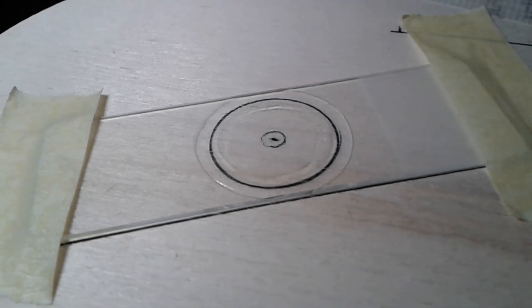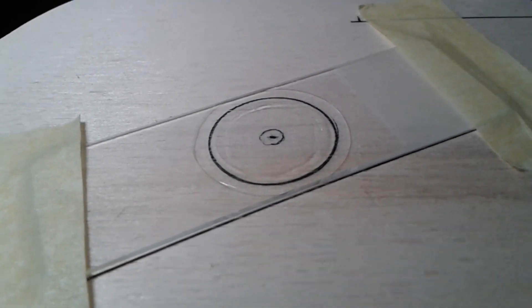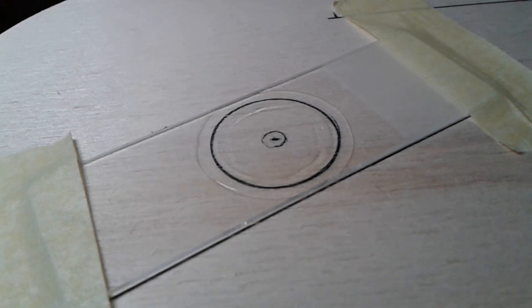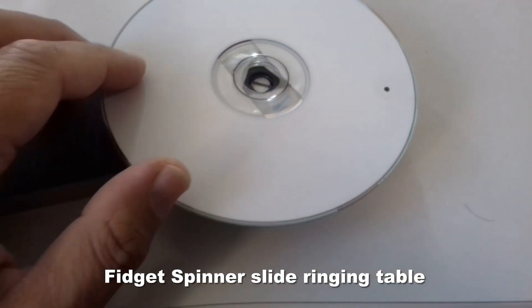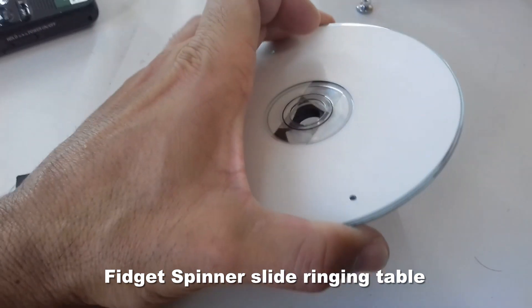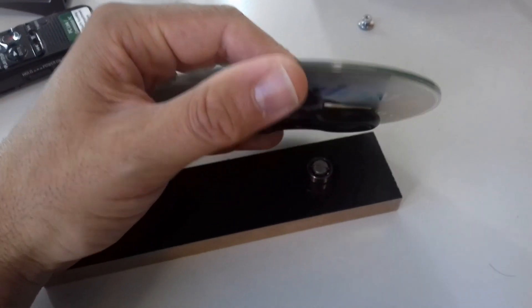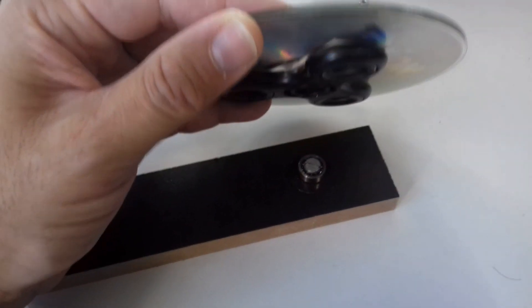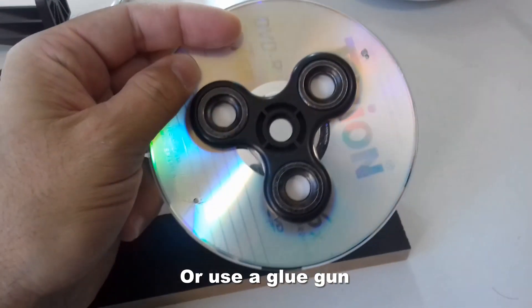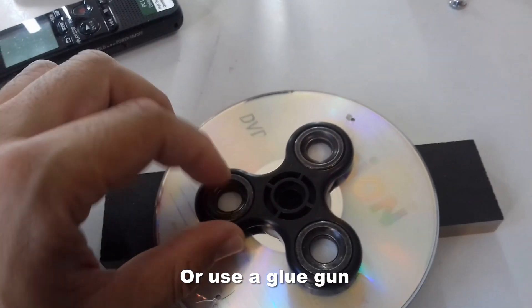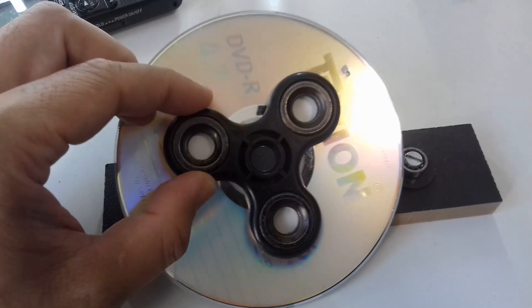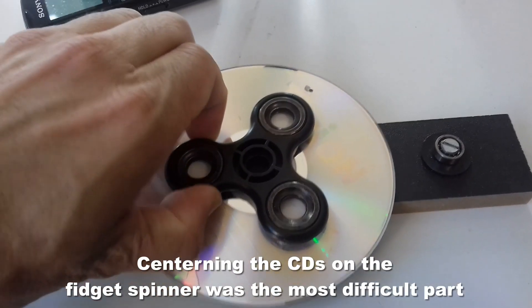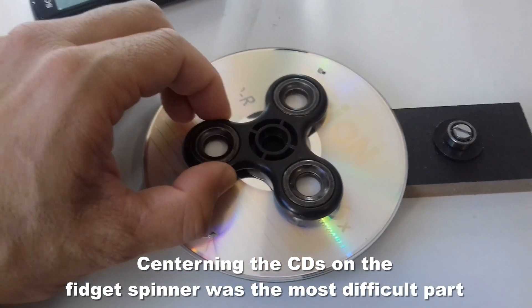I took away the clips and used double-sided tape to glue two CDs together. On the bottom side I also use double-sided tape to mount the fidget spinner. This double-sided tape is quite strong, so it's not easily possible to remove the fidget spinner without breaking the CD.